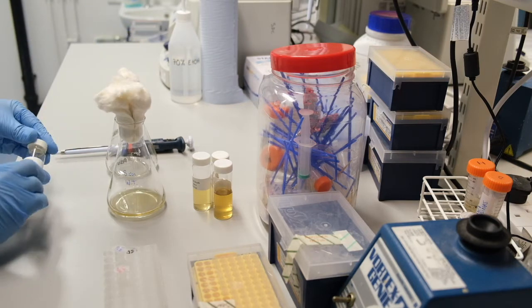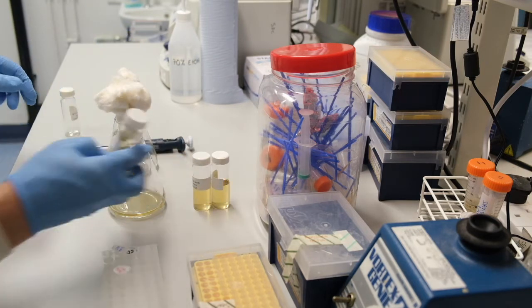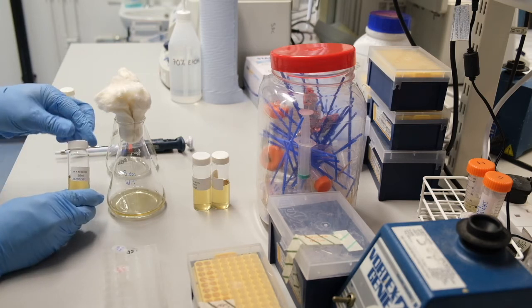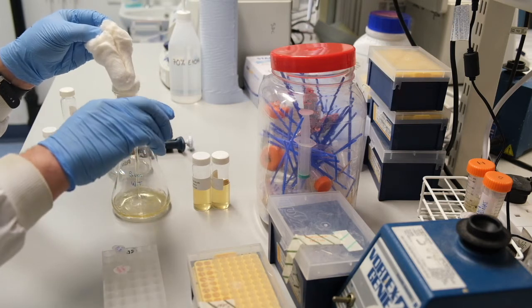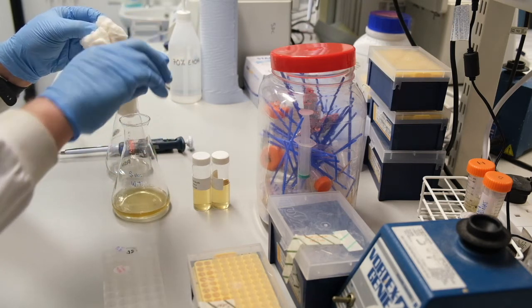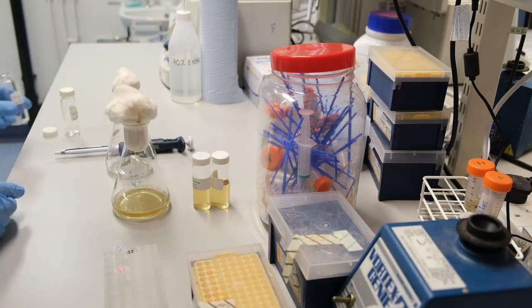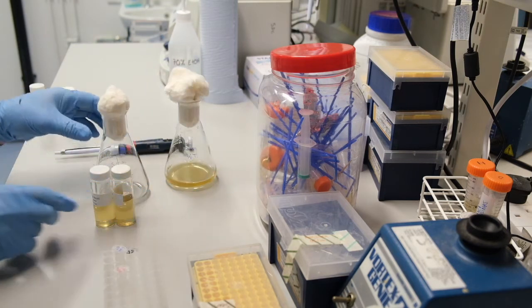A Bunsen burner could be used here to sterilize the rims of all glass vessels used, taking care not to set the cotton wool alight. As no Bunsen burner is available, I just work rapidly and avoid touching the rim of the flask or the bottles.